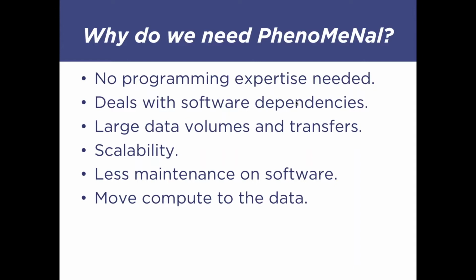You have less maintenance on software because of the way that we package software for you. So you don't need to worry about different versions of things because we take care of all of that. And most importantly, it allows you to move the compute to the data. So if you have a very large project in which you are ingesting data somewhere, and it's very difficult to move the data around networks, you can always deploy in a cloud provider that is close to where the data is ingested.